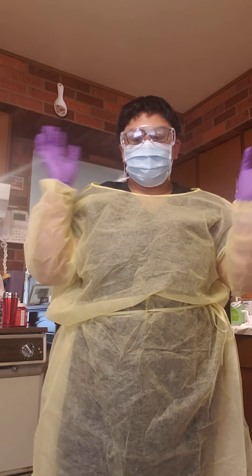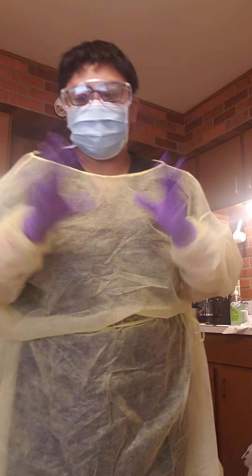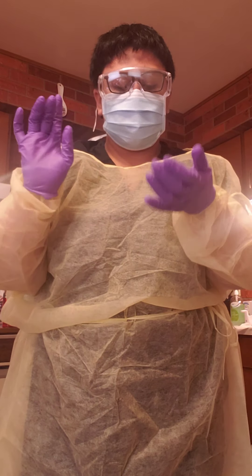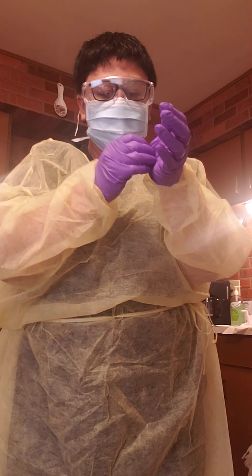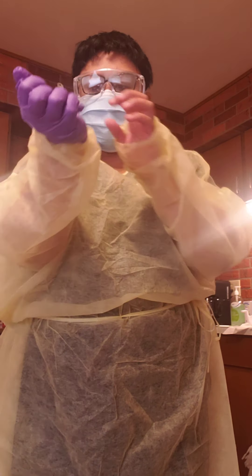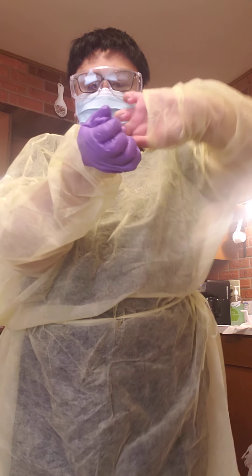Now I've done my PPE. Now I've done everything I had to do with the patient. I've walked out. Now I'm going to doff my PPE. First, we're going to start with the gloves — pinching it here, pulling it inside out, and then over here.